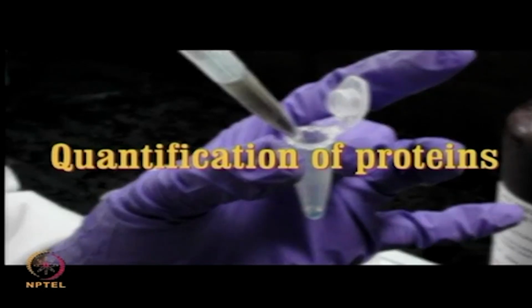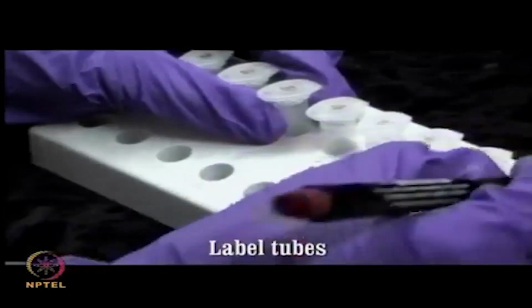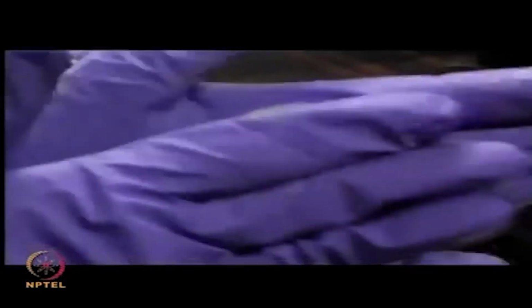Quantification of proteins. After the protein sample has been extracted from its source, it must be quantified to determine the protein content before any further processing. Label the tubes suitably for standard and test samples. Thaw the protein sample to be quantified by gently rubbing it between the palms.